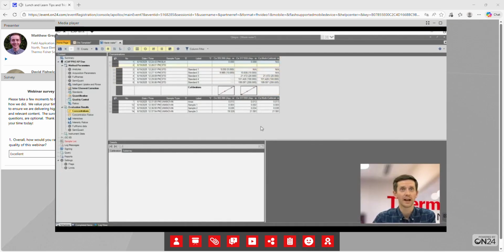Essentially we can see it's blanked out the concentrations we're not using, and we can see the multi-calibration trace. So when we look at a value here, for example, that's above our switch point of 10, 21.5, we can see it's taken it from 317, and when we've got our very low ones, for example 0.035 or 0.003, it's taken it from our nice sensitive 393. So we can see by combining the two, we've got excellent sensitivity, low limits of detection, as well as achieving nice linearity up to high concentrations.